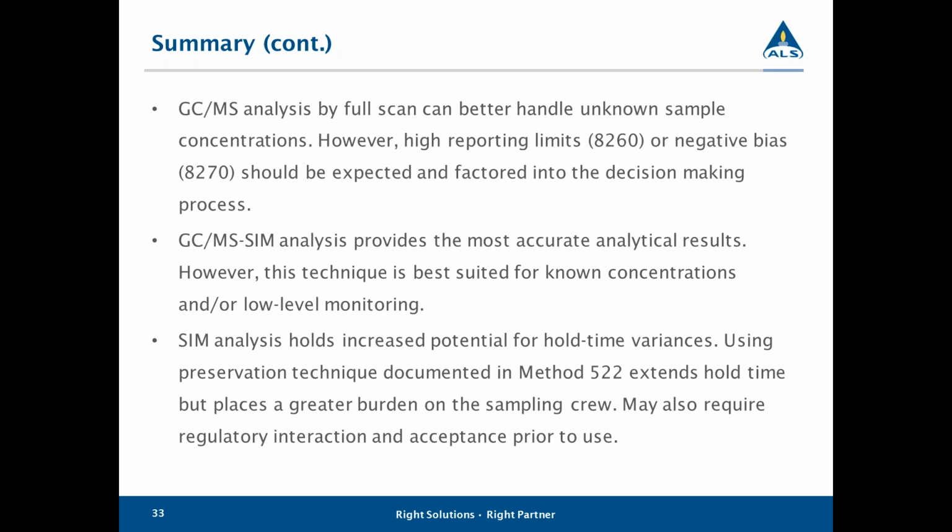The SIM provides the most accurate analytical results. It's best suited for known concentrations or low-level monitoring. And then the SIM holds increased potential for hold time variances with the preserved sample, but certainly places a greater burden on the sampling crew to get that right, and also requires regulatory buy-in prior to using that.